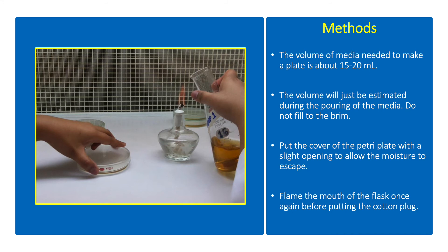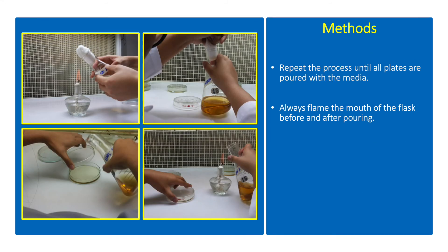Flame the mouth of the flask once again before putting the cotton plug. Repeat the process until all plates are poured with the media. Always flame the mouth of the flask before and after pouring.